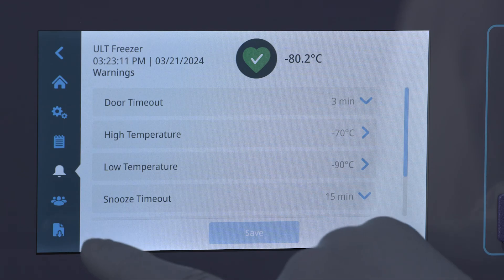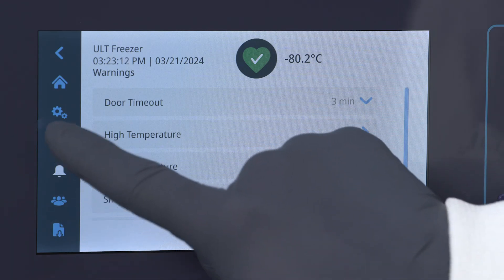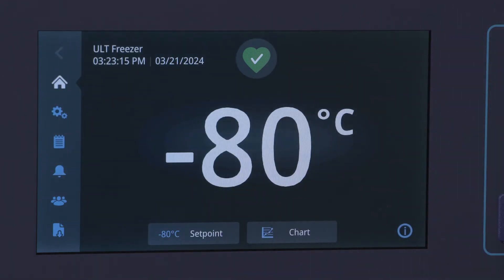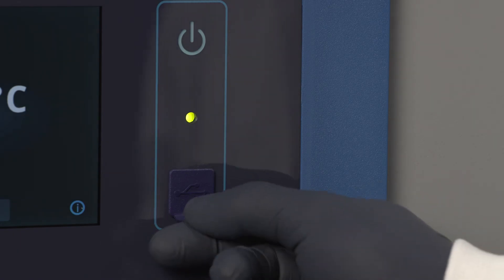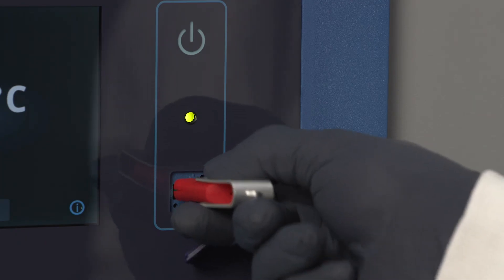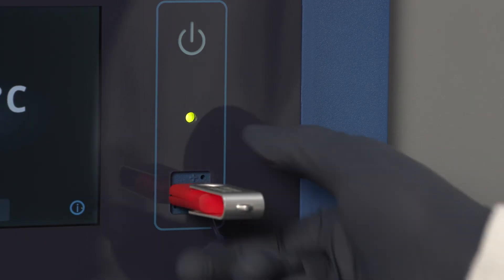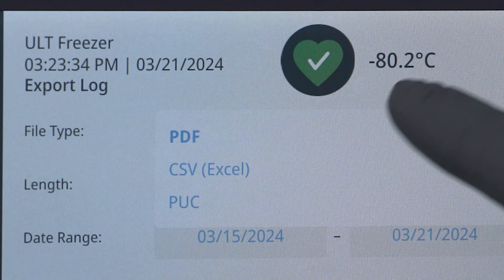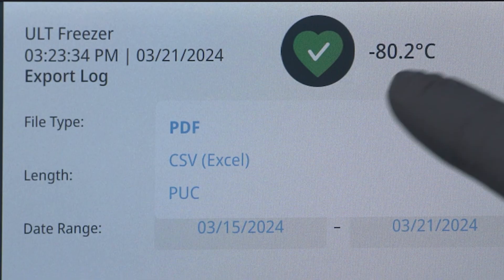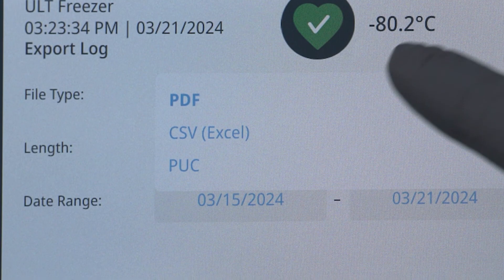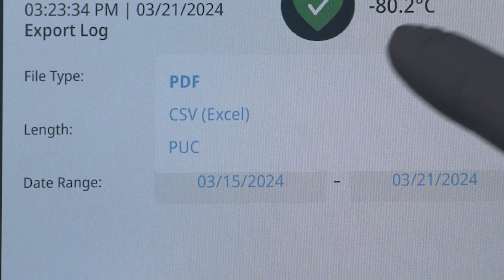Multiple temperature and system parameters are continuously monitored and stored. This information can be exported via the USB port on the front of the unit. Several different report formats can be selected and customized, including PDF, CSV, and the TSX service or PUC file.